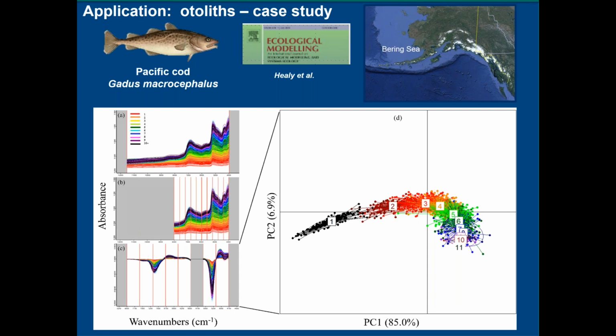Boy, I wish I had that information at this point. I could say it's substantially less, and I don't really have the numbers to support that. It's based on the fact that you can buy an instrument. Well, let's back up a minute and recognize that the goal of the technology is not to replace microscopic age readers. So in the long term, it may in fact reduce the number of people engaged in microscopic aging.